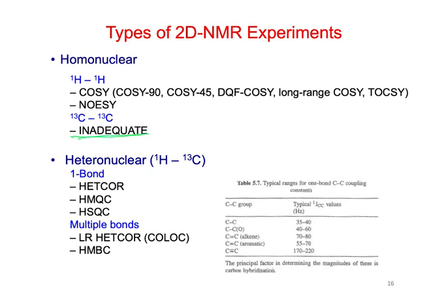Okay, so it shows us C13 coupling. So in this little table here, it shows the typical coupling constants. We haven't seen those before. Carbon, 1 bond coupling constants. So if they're aliphatic, it's in the 35 to 40 hertz range.